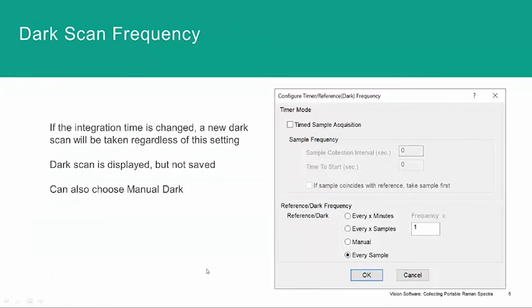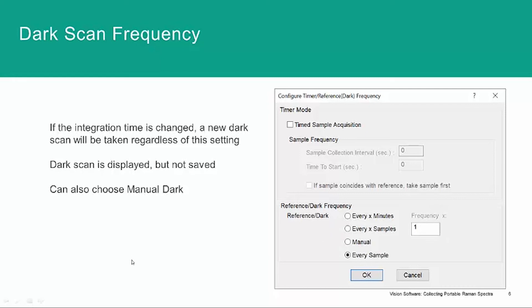The other thing that we can do in the vision software is to set the frequency of measuring our dark scan. By default, it's collected for every sample. But we can go under the configuration timer and set that to be based on time or the number of samples or even to measure it manually.